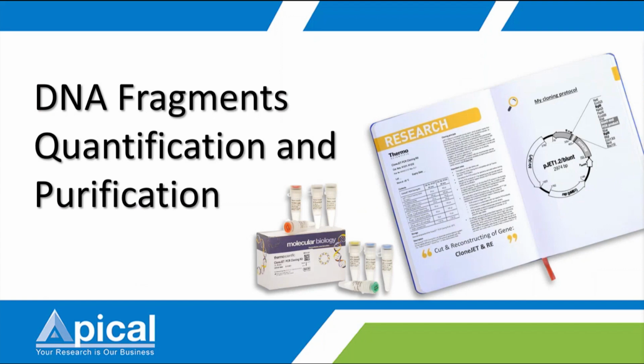After the insert and vector are prepared, you need to make sure they are clean and pure before performing your ligation, and make sure there is no inhibitor that will inhibit the ligation activity.